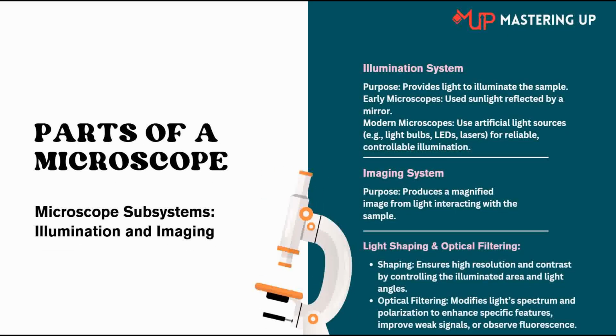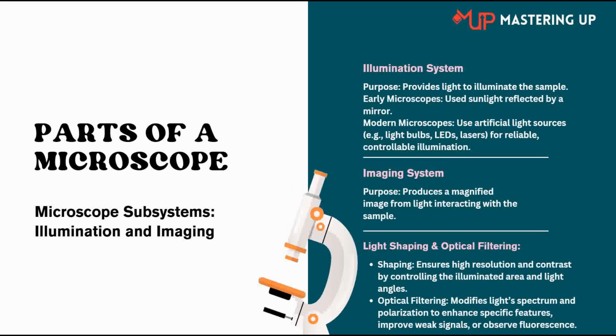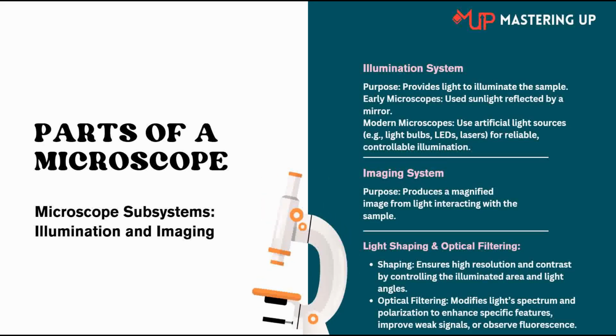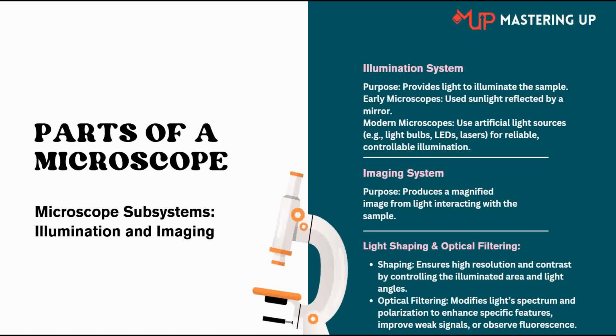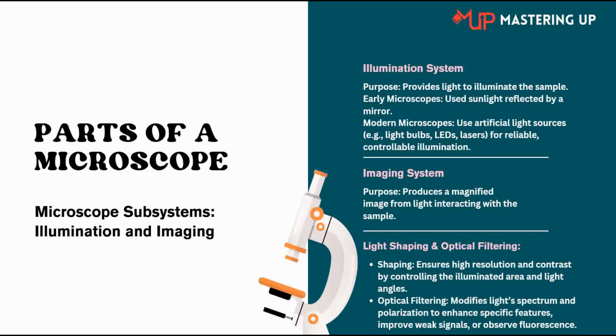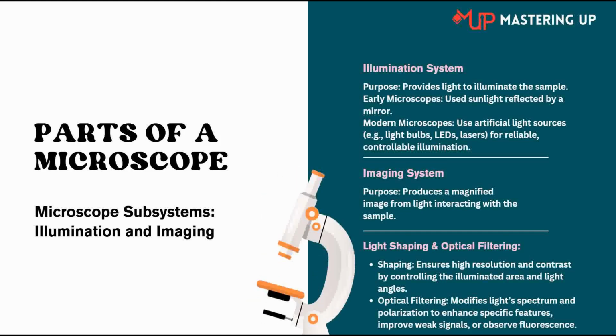Now let's see the parts of a microscope. Generally, a microscope has two subsystems, an illumination system and an imaging system. The illumination system is the one which provides light to illuminate the sample. In early microscopes, sunlight was used to observe the samples. It used sunlight which was reflected by a mirror.